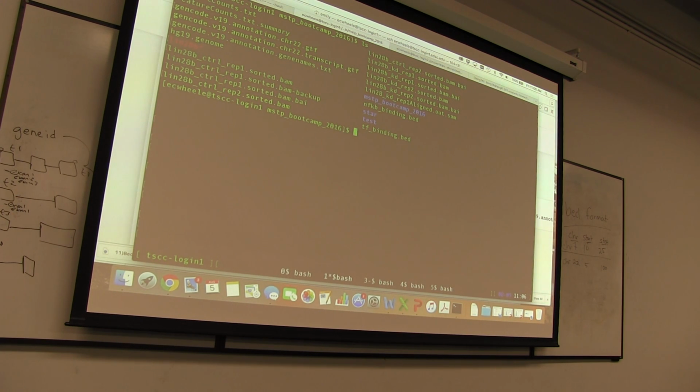And for a given set of exons that are related to a gene, we assume there's only one promoter. Well, this is why we're not looking at it on the exon level. We're looking at it on the transcript level, because the promoter is always upstream of the transcript. So we're using the start information from the transcript to go upstream from there. If we were using start information from the exons, then we would be looking at multiple locations within a transcript. You know, we'd be starting here and getting those regions. But we're just going upstream of the entire gene, so we want the start point of that transcript. You could also do gene if you didn't want to do the alternative isoforms.